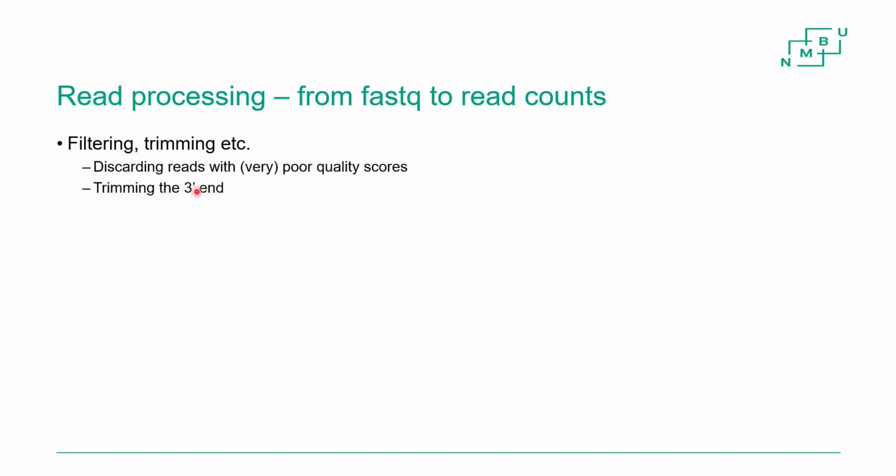This is something we usually do, but it shouldn't actually be necessary when you think about it. It has to do with how these reads are being merged from two R1, R2 reads into one. And then the merging, from read pairs to a single read, covering the whole amplicon. That's with Illumina then, if you have paired-end reads. You can, of course, do metabarcoding with single reads as well. Then you have no merging step.